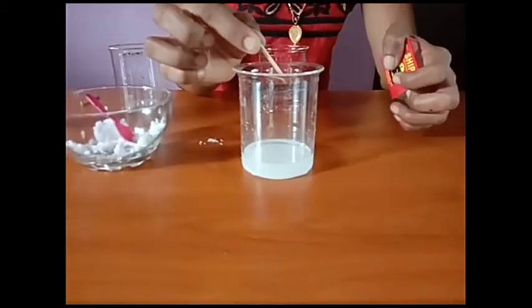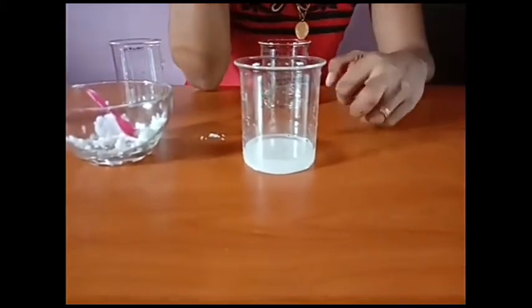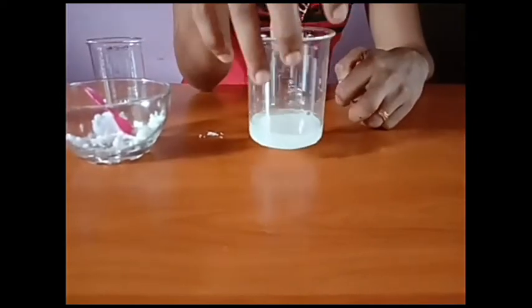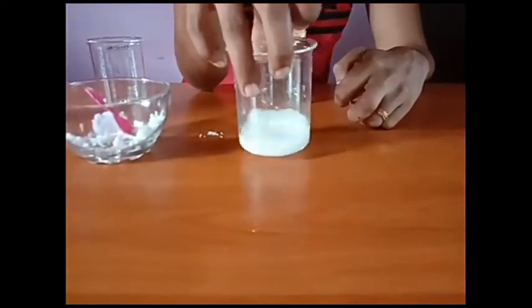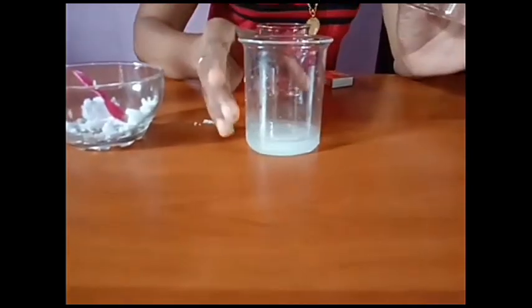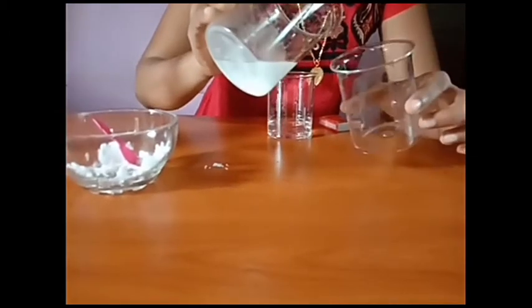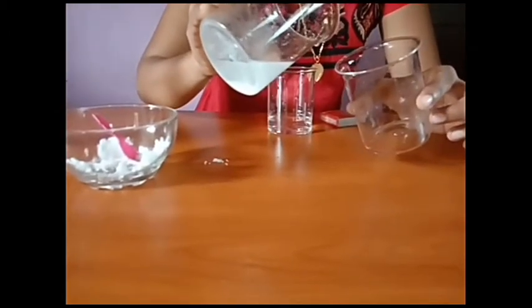The matchstick extinguishes, which means this gas is carbon dioxide. A metal hydrogen carbonate reacts with an acid, releasing carbon dioxide gas, and a salt and water are also formed during this reaction. We can separate this water and salt.